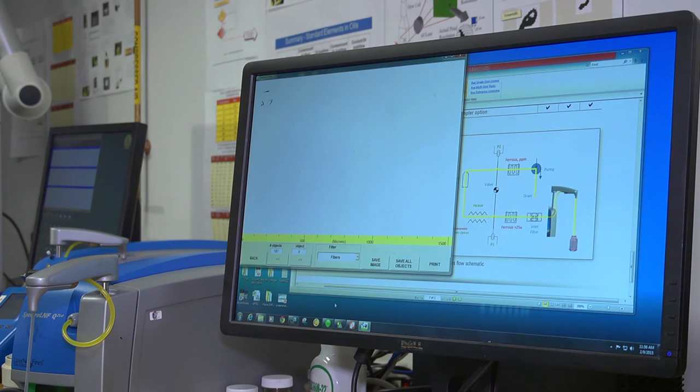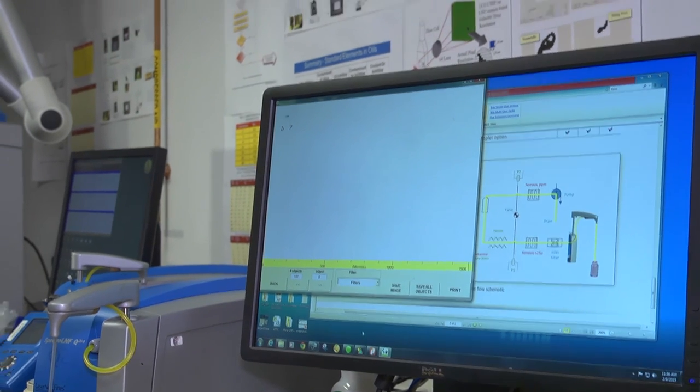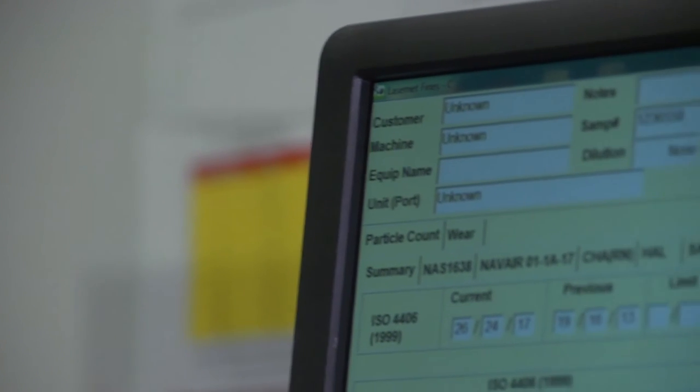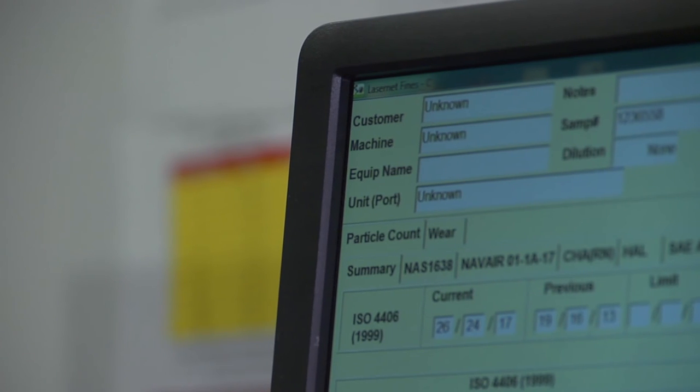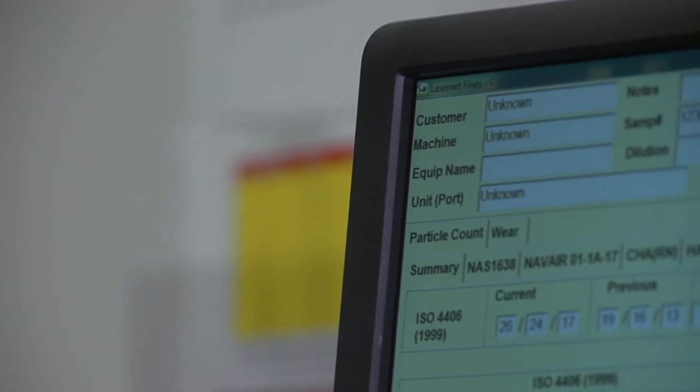And finally, you can look at fibers, which are these long strings, typically from mechanical seals that are starting to fall apart. So that's a brief overview of the wear classification and why we can actually generate actual images.